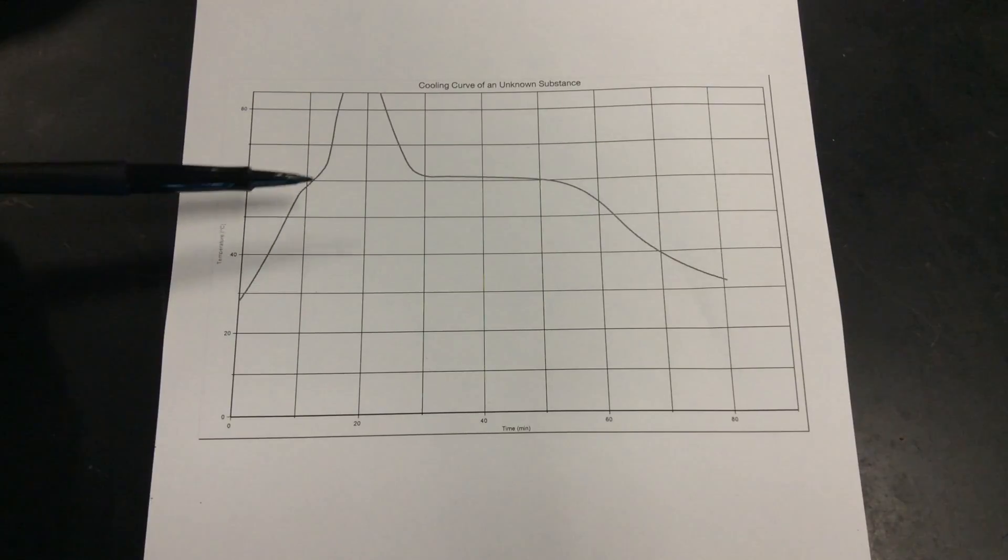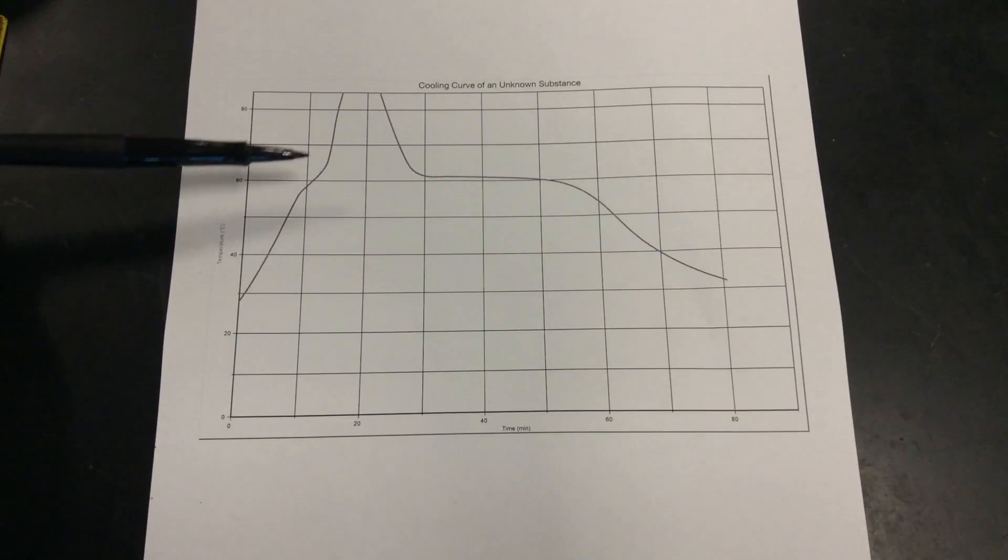We can't really get a value for where it is the most flat lining or where the kinetic energy is the most constant because there was too much energy being absorbed too quickly by the thermometer. Too much heat there. It just wasn't sensitive enough.